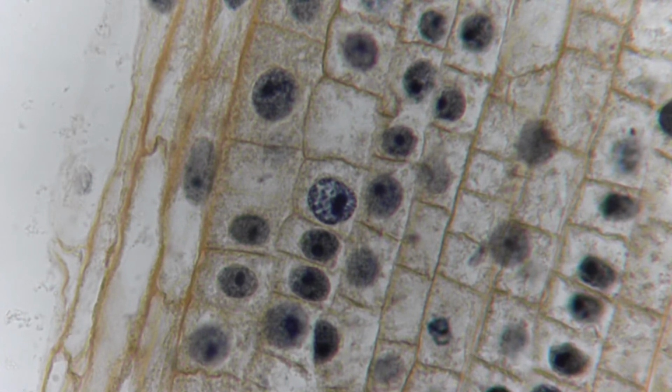So those 2 cells right below that prophase are daughter cells. They're just baby interphases, and you can see that they each have a cell wall, each have a nucleus with a nuclear membrane, and that chromatin network inside. So daughter cells are just 2 just formed interphases. That's going to be procedure 6. And you'll label all the parts that you had on interphase, but you'll put some on one of the daughter cells and some on the other.